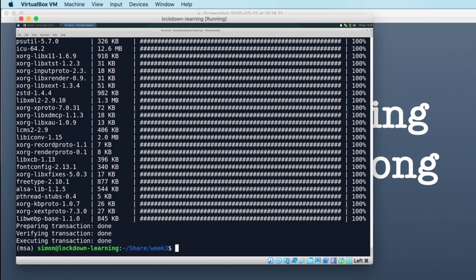So that's going to be one exercise, and then we need to start to think about how we're going to analyse it. We'll need some software at the command line to do our initial QC and quantification analysis, and I'll do an introduction to RNA-Seq just so we're all on the same page about what we're actually trying to achieve with RNA-Seq analysis. I think that will probably take most of next week, if not all of next week.